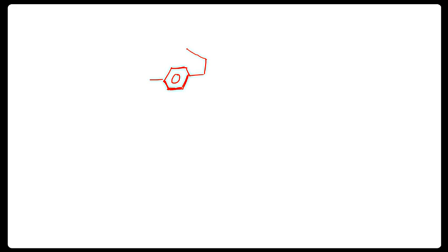Let's think about this kind of complex, or we can also have a better drawing with one more carbon atom. Here we have two protons, H, H. Think about the position of these protons.